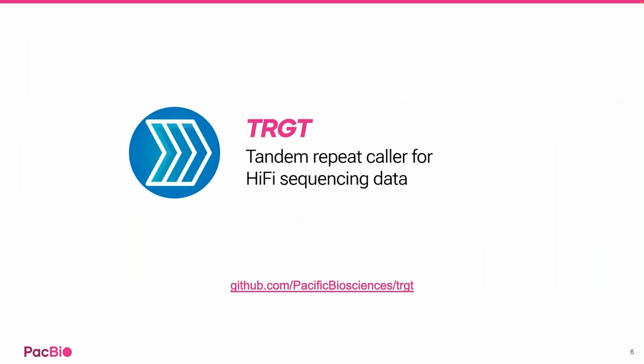For the rest of the time, I would like to dive into some of our more advanced and recently developed tools. Let's start with TRGT.